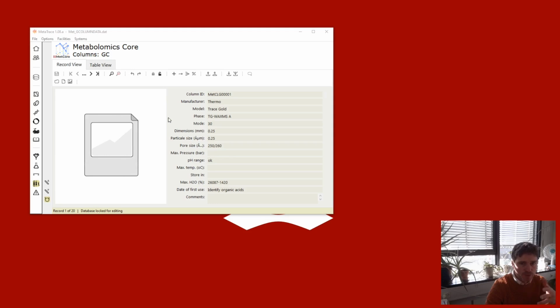So now we've looked at downloading records using these buttons from collaborators and from these facilities. But what we should also look at is uploading one of our own personal database records to a facility.